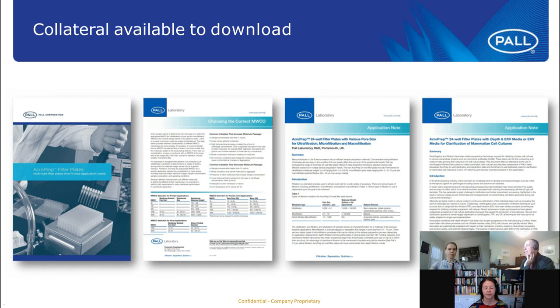Again, I think I just want to add, sorry, Jorgen, that the height would need to be considered. As I mentioned, we do have those plates coming with short and longer outlet tips. So as long as the height of that plate is compatible with your centrifuge or even liquid handling systems, you would be okay.